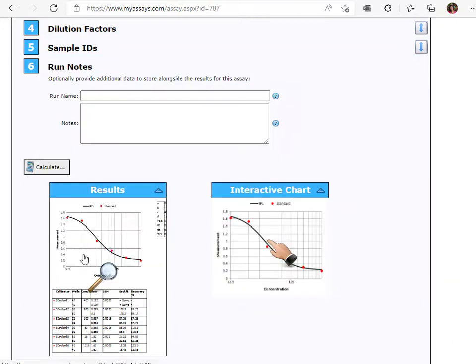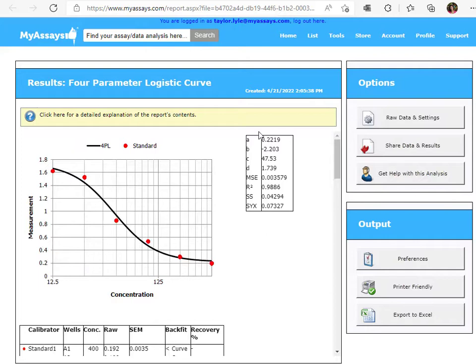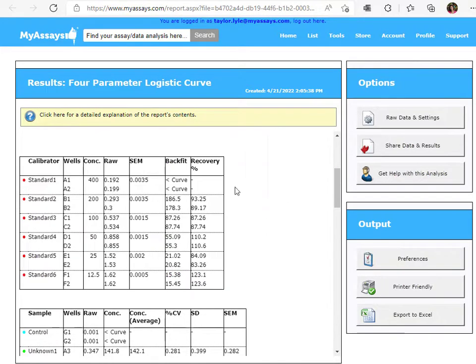Opening results displays the full report. The curve chart appears first, with computed coefficients and goodness measures reported in this table. The curve data table displays the standard results, including percent recovery. The closer these values are to 100, the better the fit.